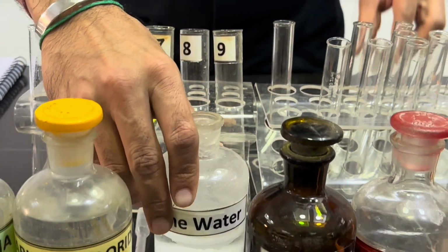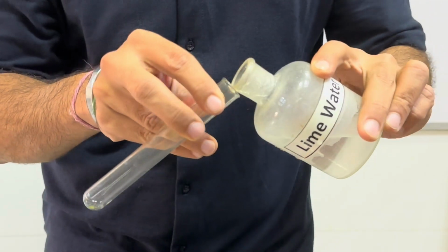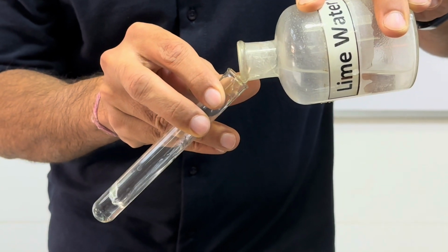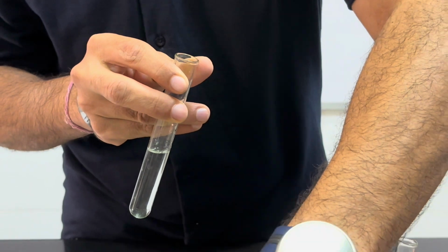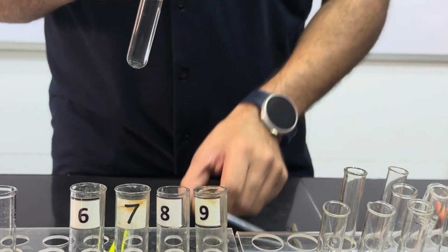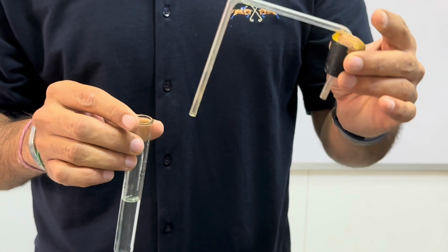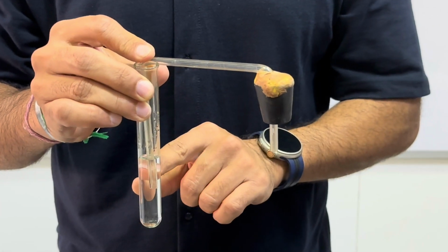So let's take this lime water in a test tube. This is our delivery tube, which must bring the gas liberated to this solution so that it turns milky white.